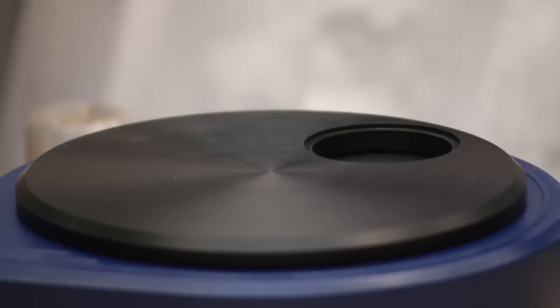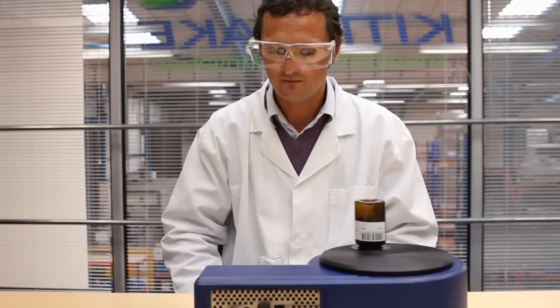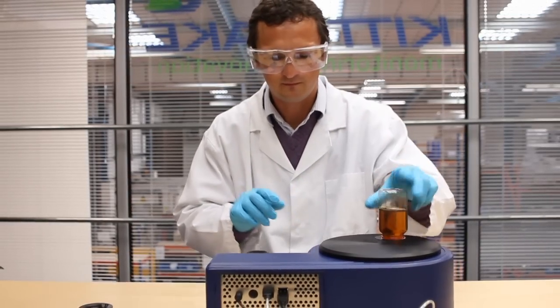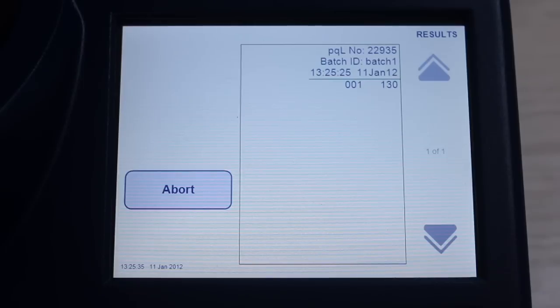Using patented sensitive magnetometry, the PQL provides instant readings without sample preparation. The sample container is placed upon the device, resulting in a PQ value returned in approximately seven seconds.